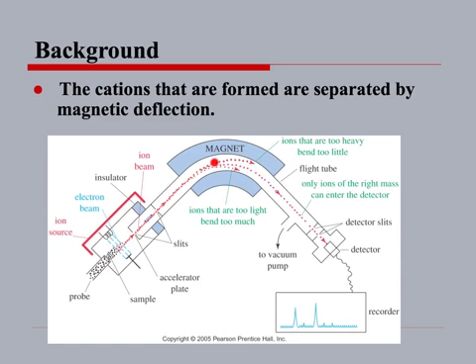you can see one beam, and small and big dots are present. They separate into 3 streams: very small molecules as far as mass is concerned, the middle is the medium size molecules, and the bigger ones are the big size molecules. They follow a different path when we pass them through the magnetic field, and depending upon the slit where these ions are passing through, the detector can detect and give you a chart showing which line they are following, which angle they are following. A bigger angle is for a smaller molecule, and a lower angle is for the larger molecule.